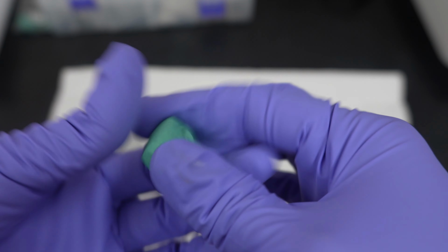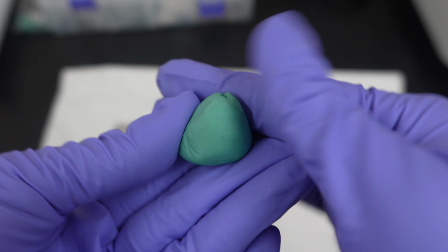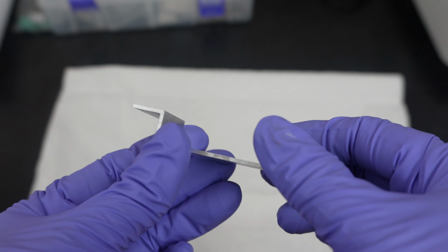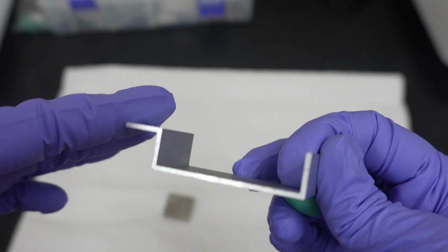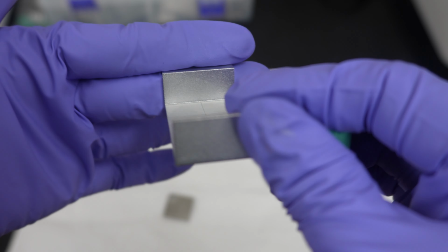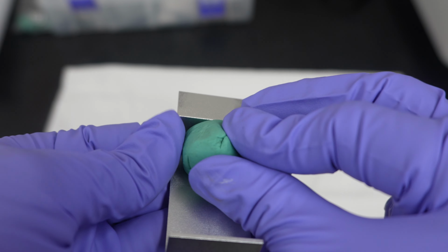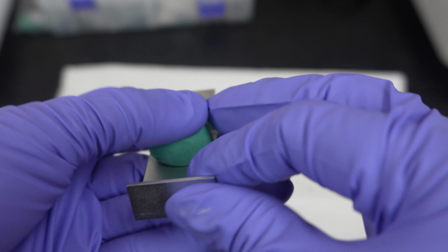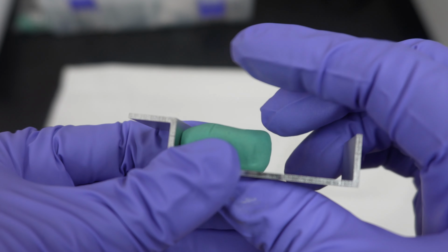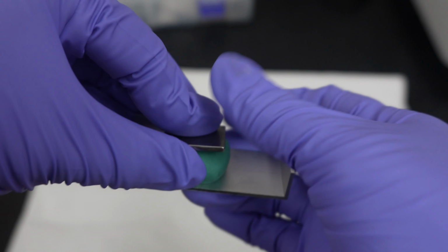So first, we prepare the clay for the first sample, the bulk sample, and then put it on the holder. As you see, there are two different edges, and this edge will be used to hold the sample by the slit. Okay, we place the clay near this edge. We do it like this, pressing a little bit, because we need to make it flat. And put the sample on top.